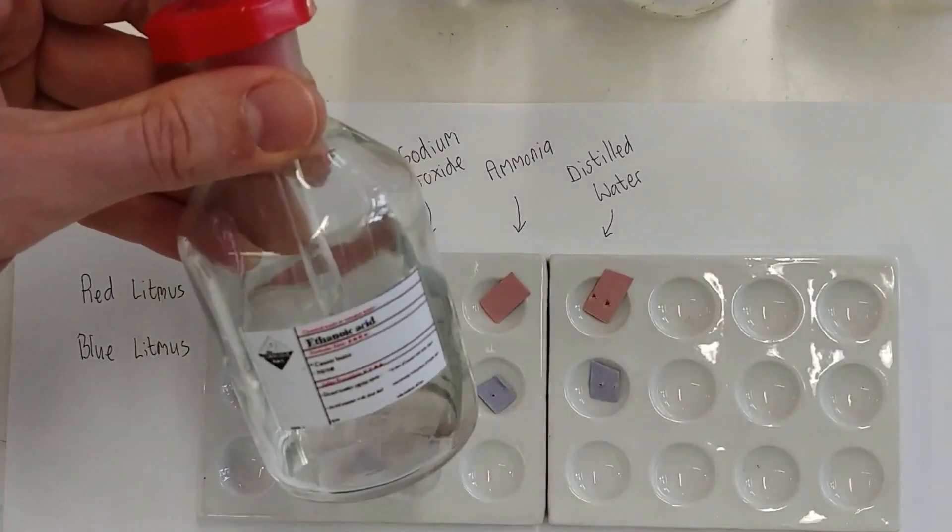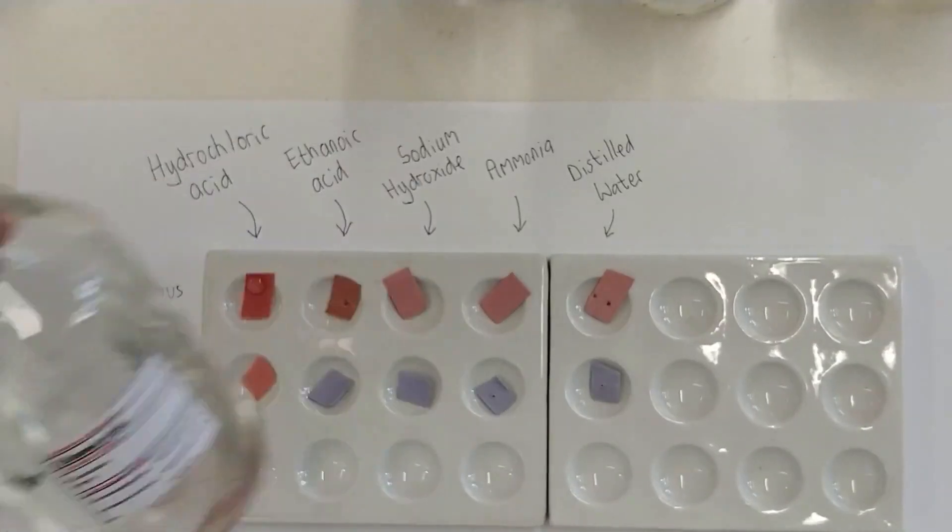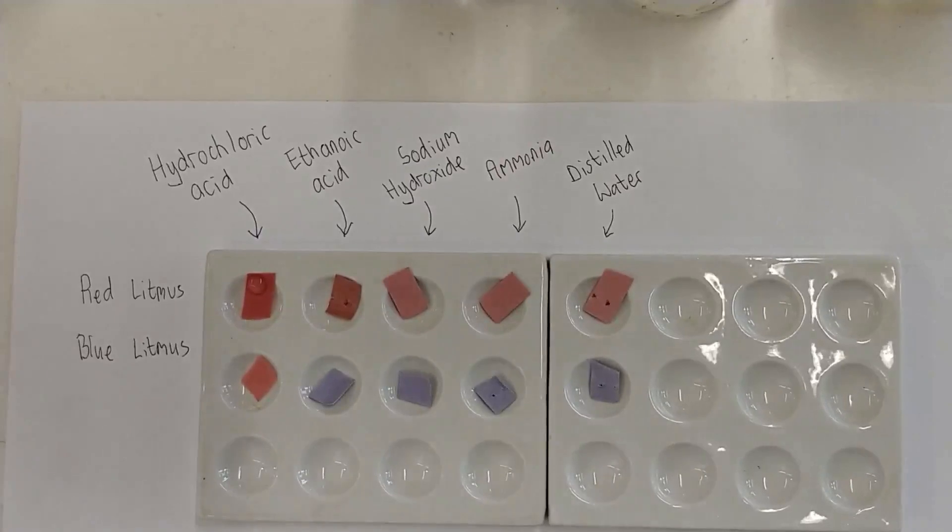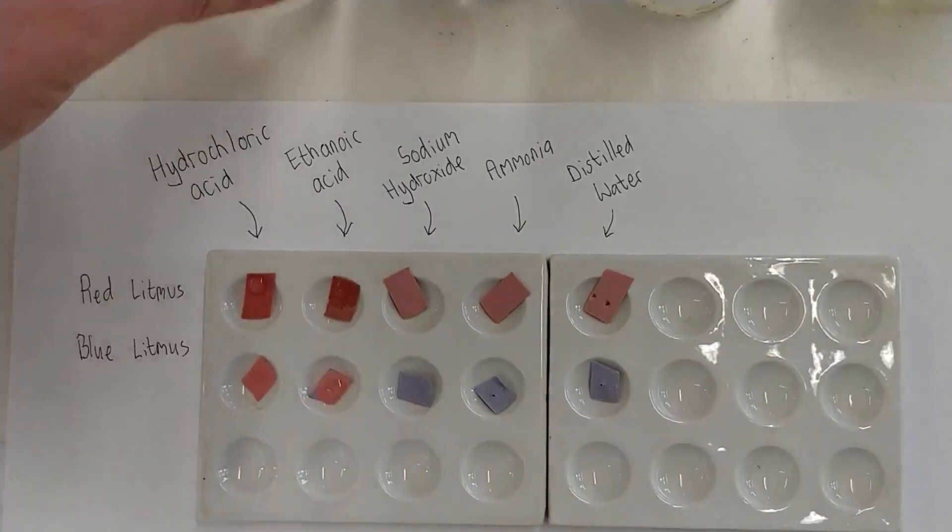So on with the second one. Ethanoic acid, more commonly known as vinegar. Drop it on the red one, drop it on the blue one, and it changes the blue one red.